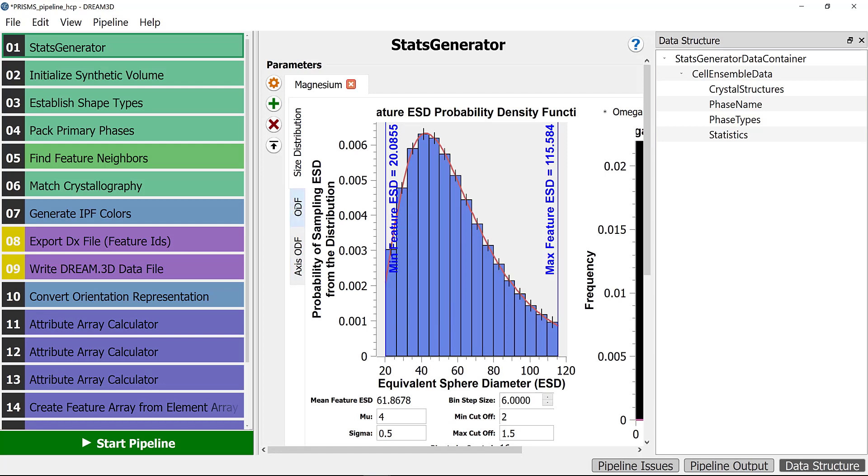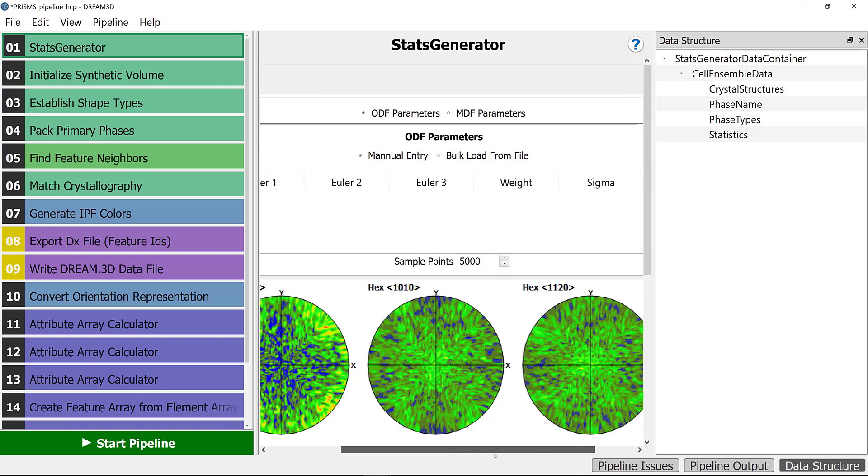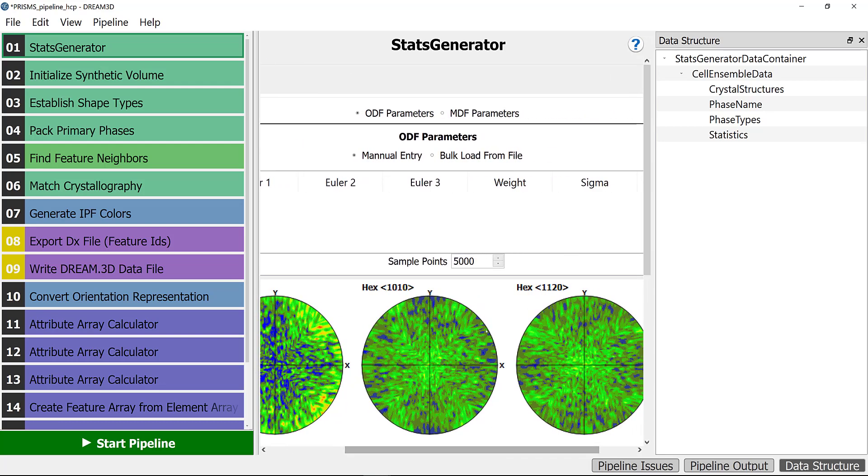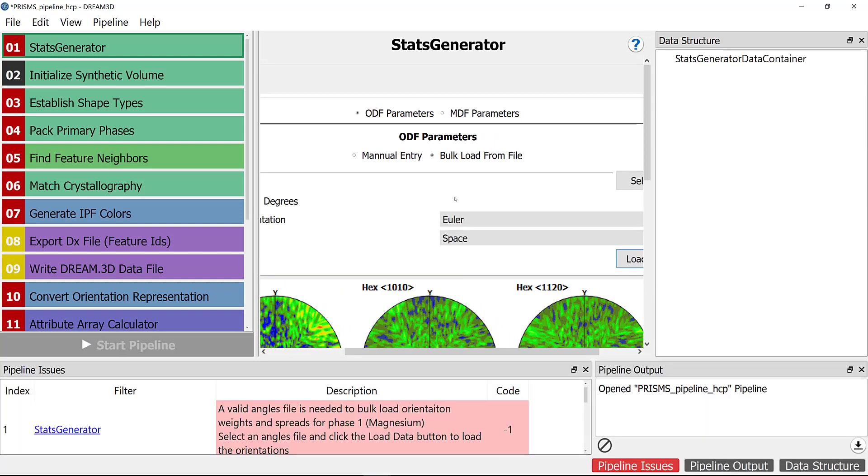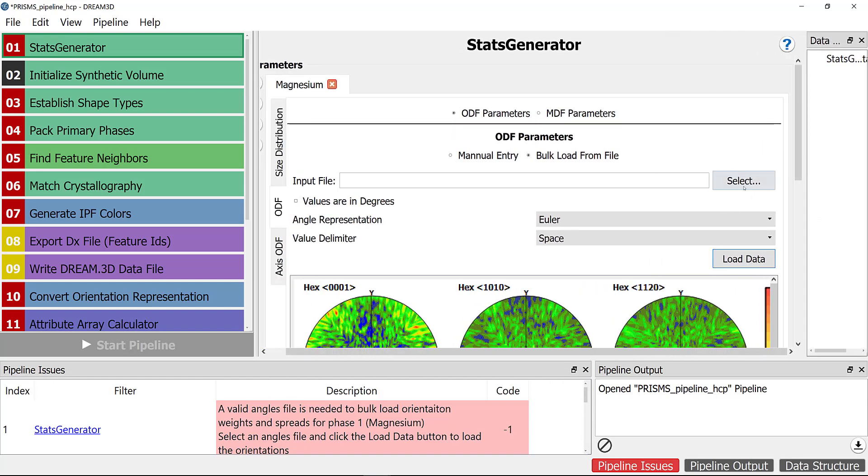In the next step, you need to go and click on the ODF to input the orientation files. We are choosing 'bulk from file', so here we need to select our EBSD file, but you need to do some modification first.